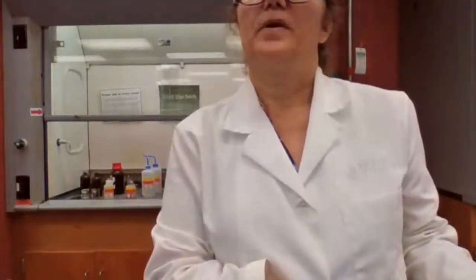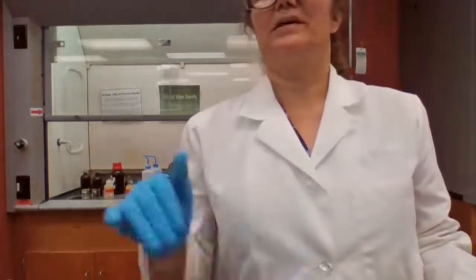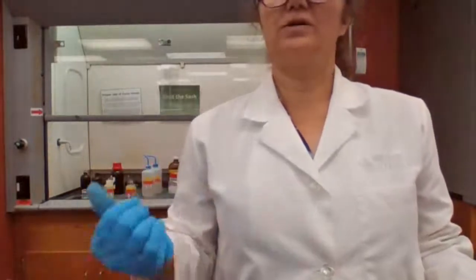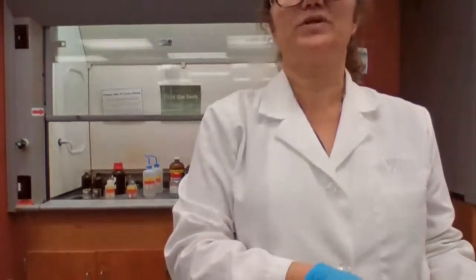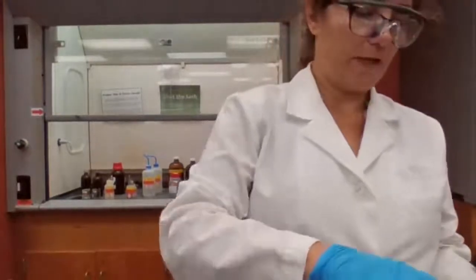Hinsberg. Dimethylaniline would act the same as methylaniline for water, for sodium hydroxide, and for HCl. Please record that. Not soluble in water, not soluble in sodium hydroxide, but soluble in HCl. Very good.